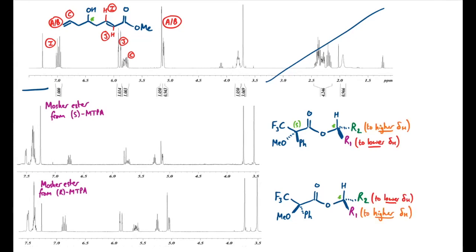So there have been some changes in general, so we can't compare these ester structures completely to the original alcohol. We'd expect some of the shifts to change around. In fact, that's the whole point of this method, just keeping an eye on what has changed. One thing that we can note, we've got an extra OMe peak, an extra 3H singlet in both of these structures. That's completely reasonable, of course, because we've got an OMe group coming from the Mosher ester itself. So that's a good check that that's on.